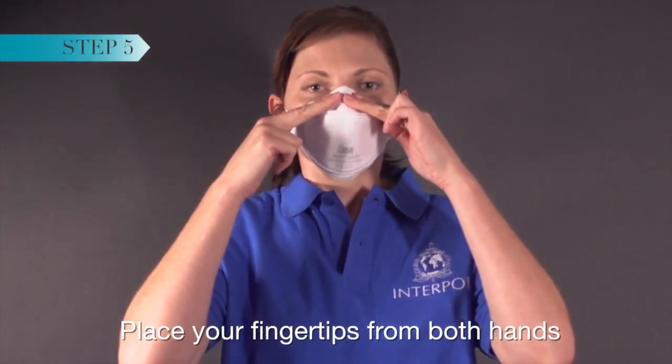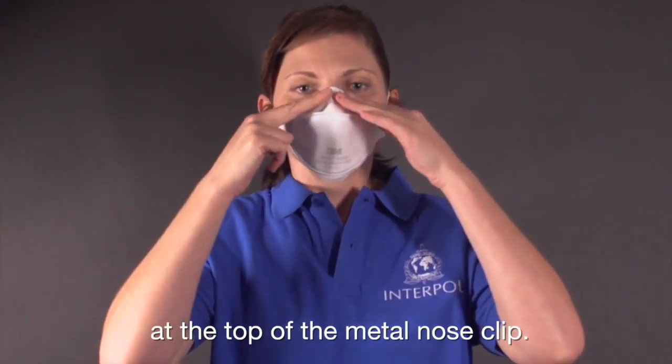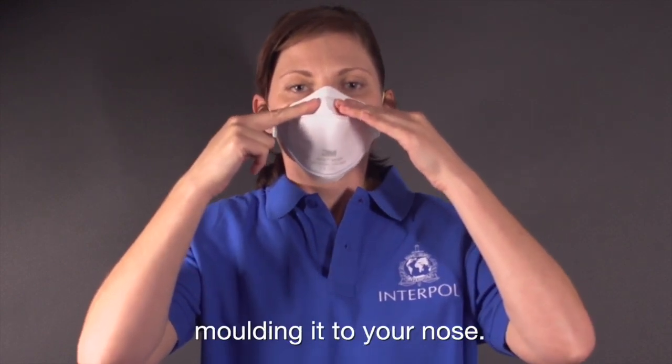Place your fingertips from both hands at the top of the metal nose clip, slide fingertips across and down, molding it to your nose.